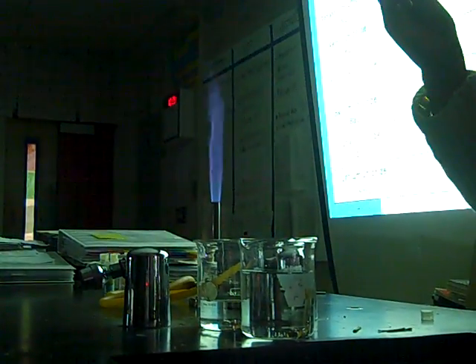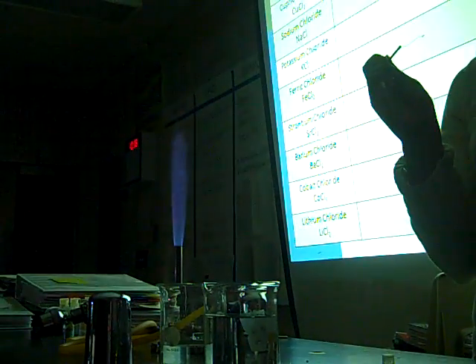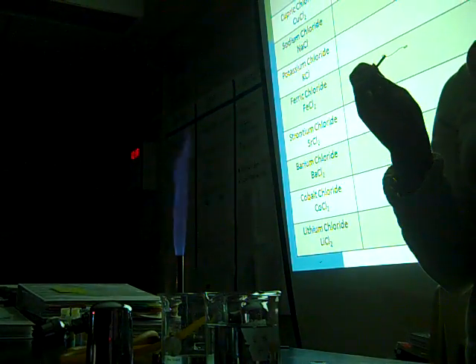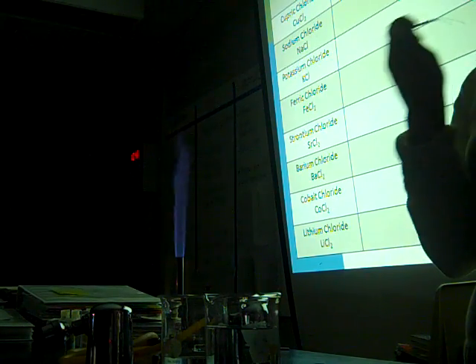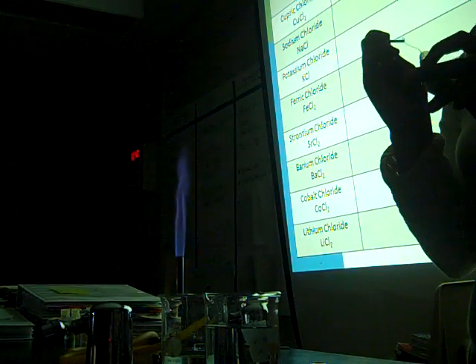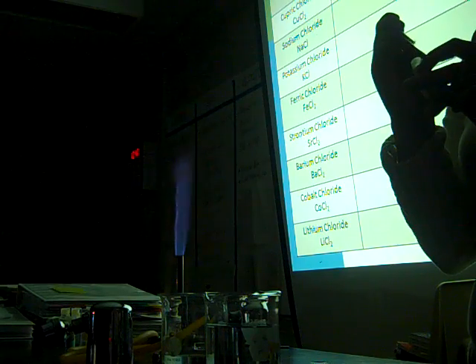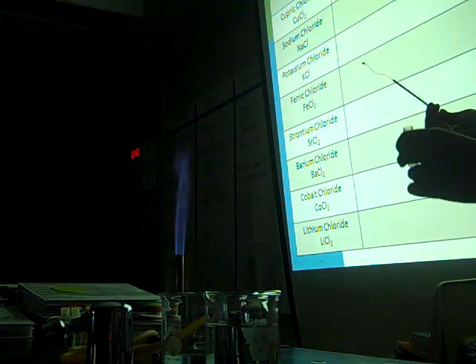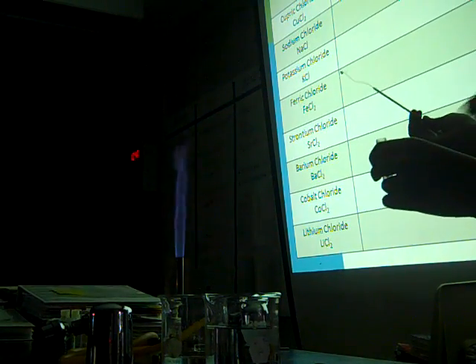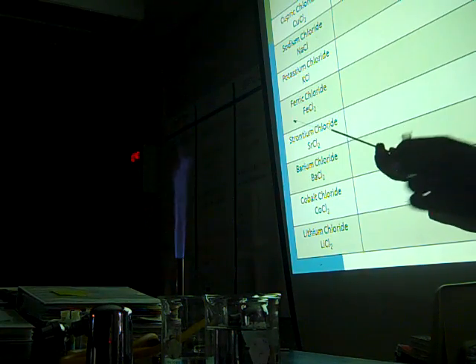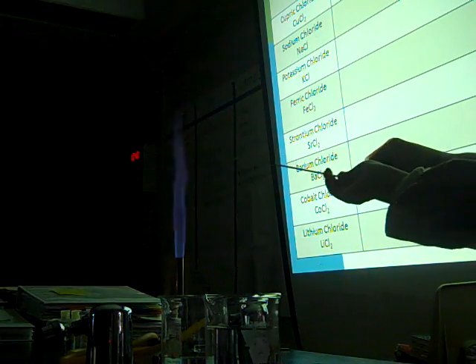All right, so this is ferric chloride. Siope, what do you see about ferric chloride? It's yellow, definitely. It's kind of yellowy, kind of golden yellowy, sort of brownish. Brownish. It's going to spark. All right. Can I stand over here, Siope? Oh, my favorite one is ferric. Yeah, okay. And just put it right about here, in the flame. Okay. That's here.